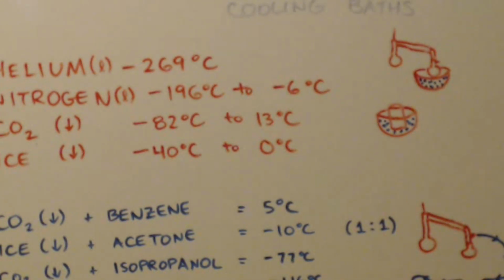And I used to know about, when I first read about dry ice and using it, I really at first didn't understand what they meant. What do I do with the dry ice? Because dry ice is a certain temperature. I think it's like minus 109 Celsius, or I'm not sure. But how do you get the different temperatures? What if I need to be at minus 10? Or what if I need to be at minus 77? How do I get it to be exactly a smooth temperature, like throughout the whole reaction?